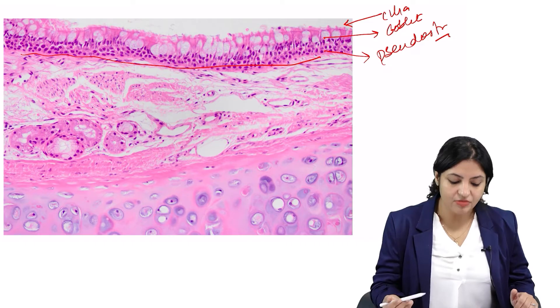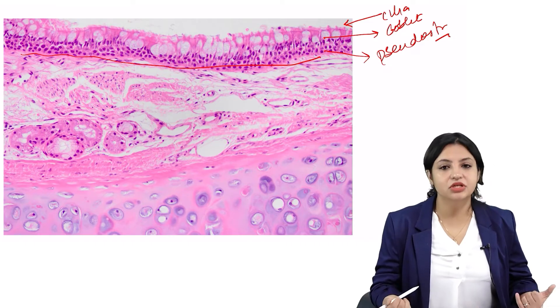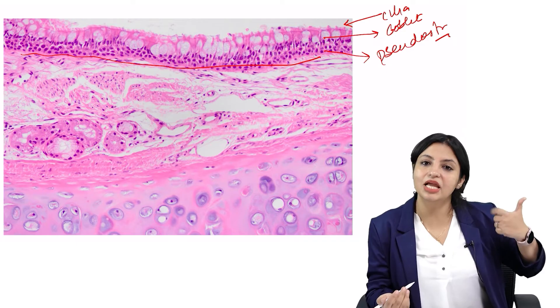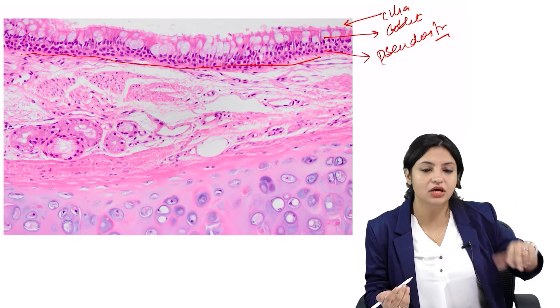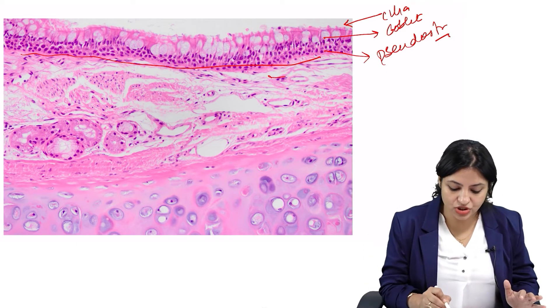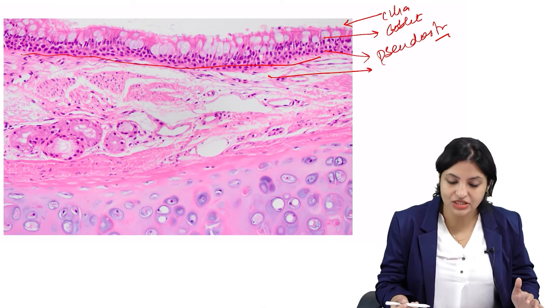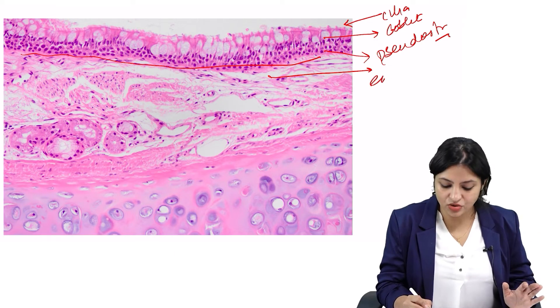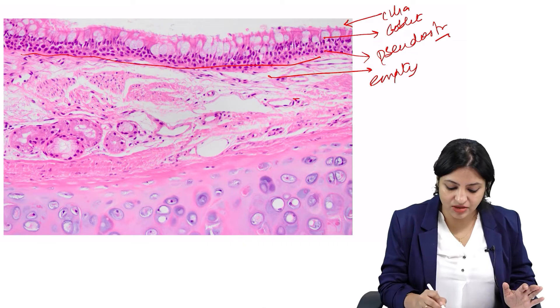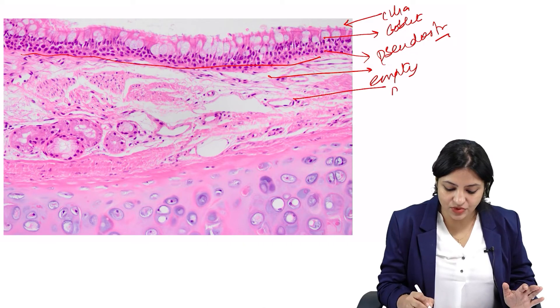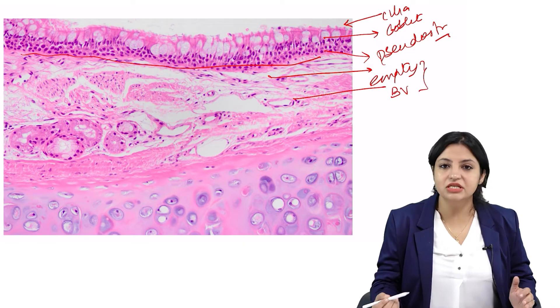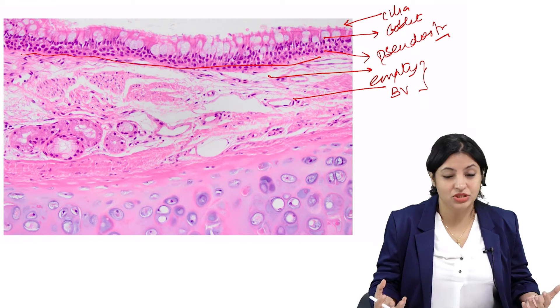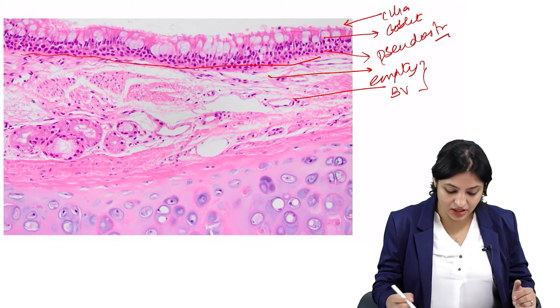Coming below that — mucosa has epithelium, lamina propria, and muscularis. There is some loose tissue here with empty spaces, which is part of the lamina propria. Lamina propria is usually made up of loose tissue and blood vessels.